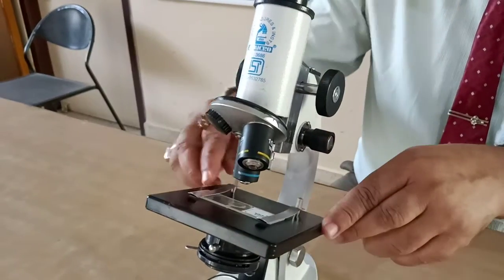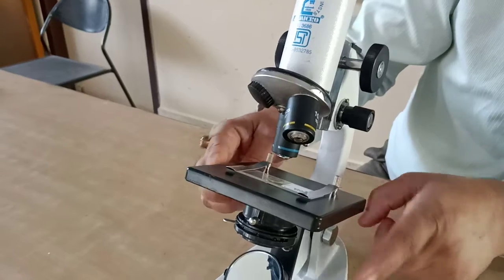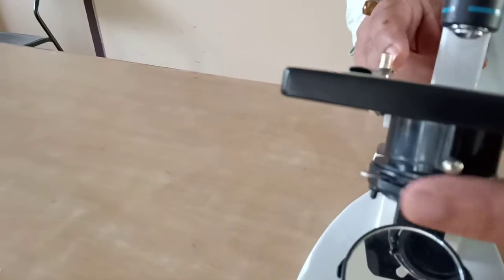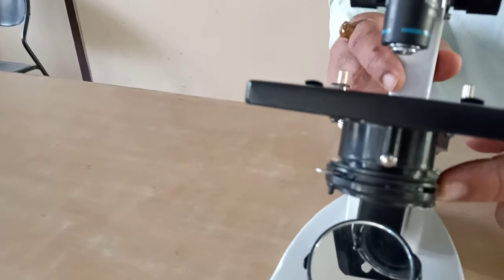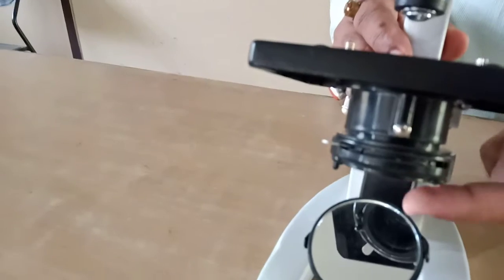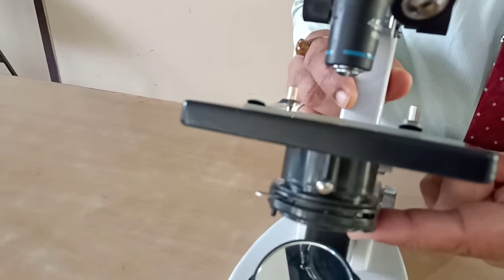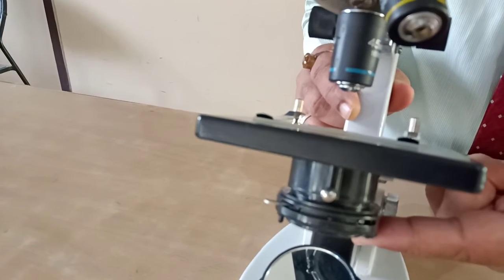Under the stage there is a structure called the diaphragm. The diaphragm also has a lens, and we can set the aperture of the diaphragm lens.